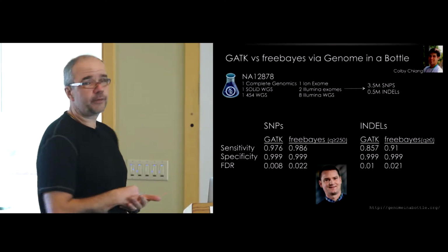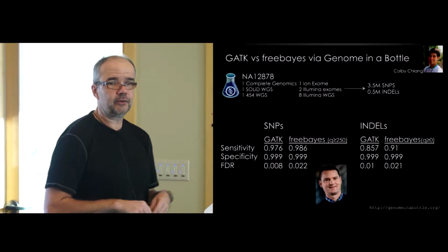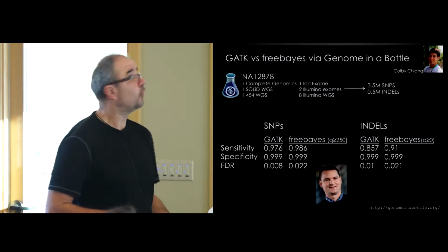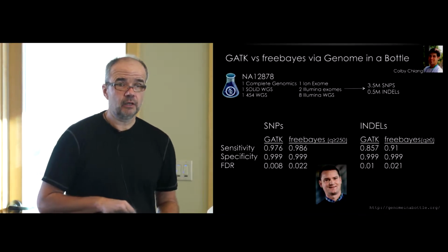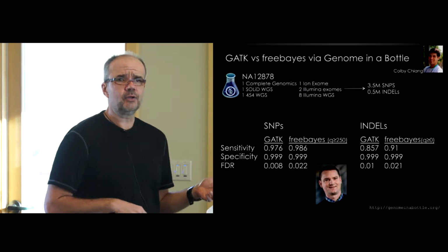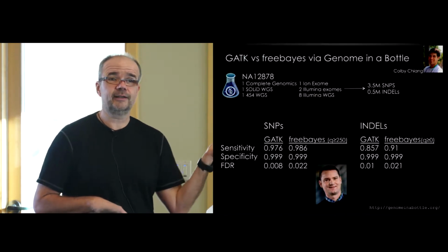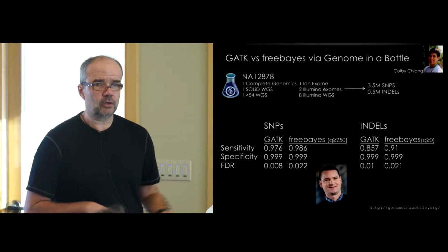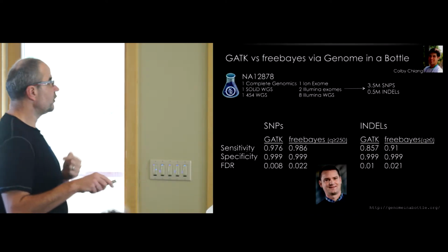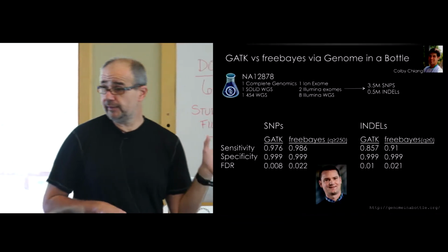All this research is very collaborative. We basically work with all our competitors to move the field forward. So GATK is the other very important variant caller. And you guys, are they going to use GATK in the practical sessions? No, but you could, and that's the premier variant caller. So I just put it in this slide to give you an idea of what the accuracies are for SNP identification today.